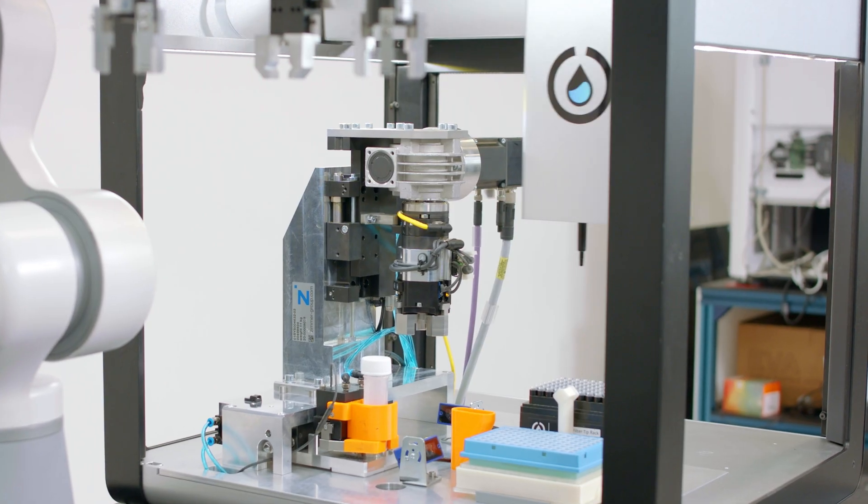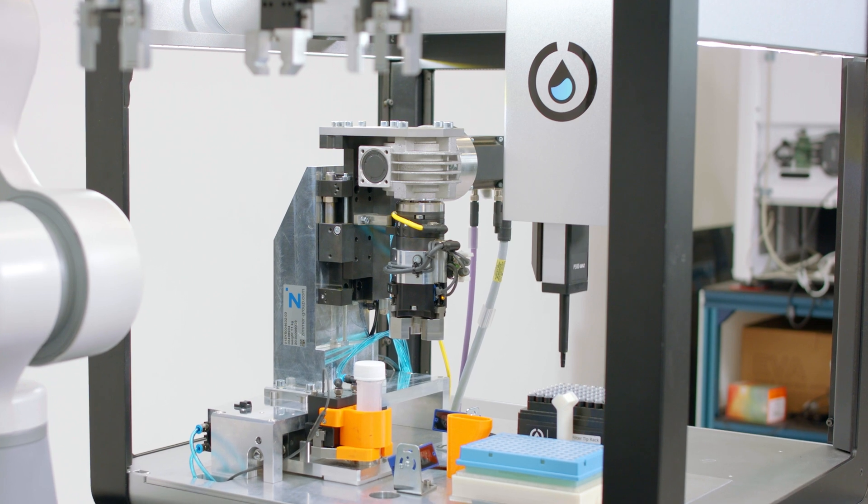A lot of lab managers think they have to replace the machines that they've known and loved for years, and that simply isn't the case. Automata has an extensive library of drivers that can allow some of the most popular products in the market to connect in and leverage the power of automation from there.